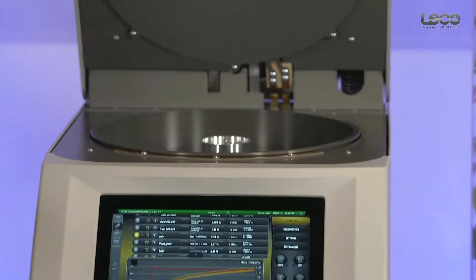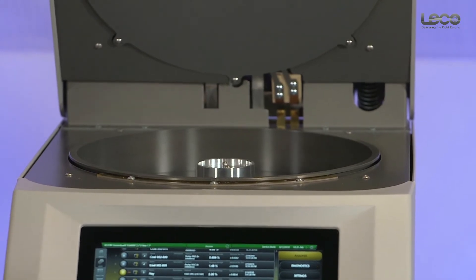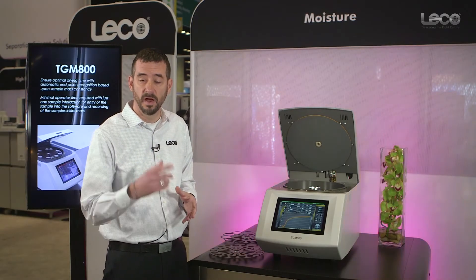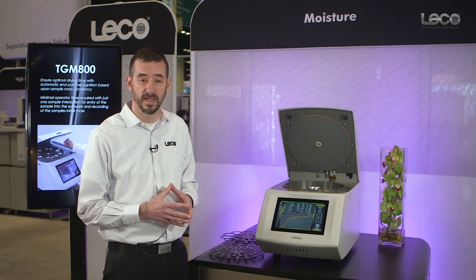The center of the oven is a carousel spindle that indexes the samples carried inside the carousel and crucibles to the pedestal, and automatically indexes sequentially to record those masses during the drying analysis.